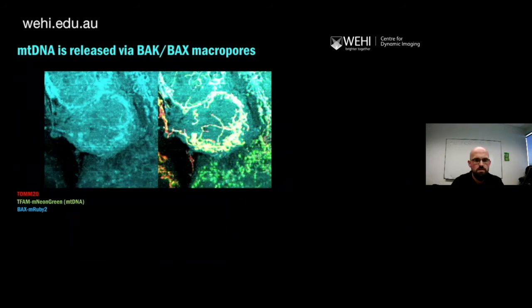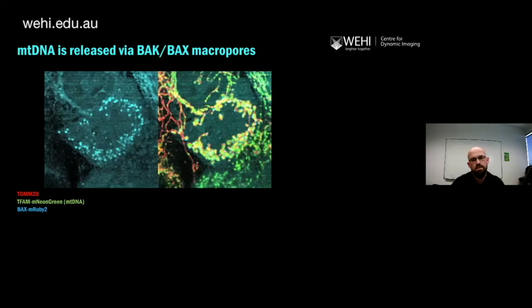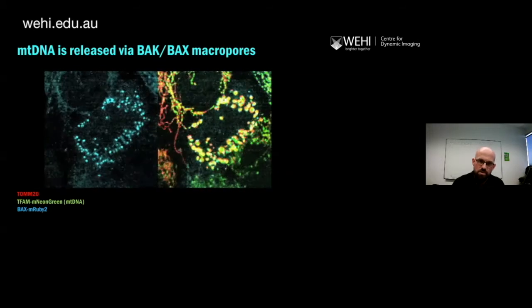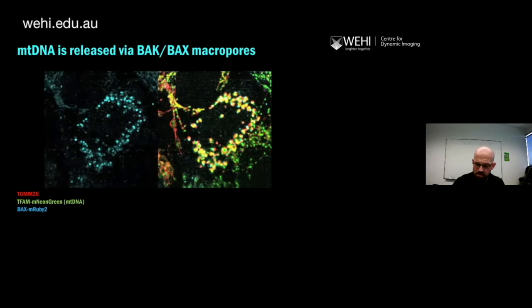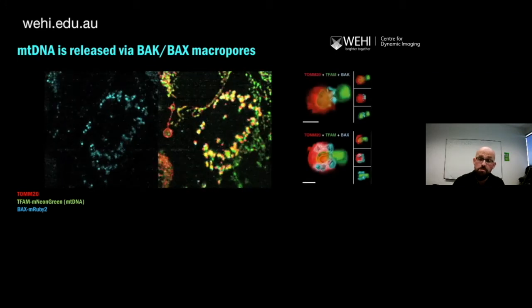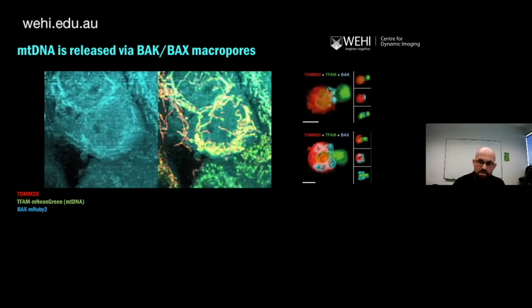So then they decided, well, what do we do? Well, we label BAX and BAK, or in this case, in this video, BAX. Watch what happens. It starts off as a cytosolic protein, which, as the cell dies, becomes punctate and locates to the mitochondria. Now, if you zoom in on this and have a closer look in 3D, you see that both BAK and BAX locate specifically to the constricted region with the DNA squeezed out.